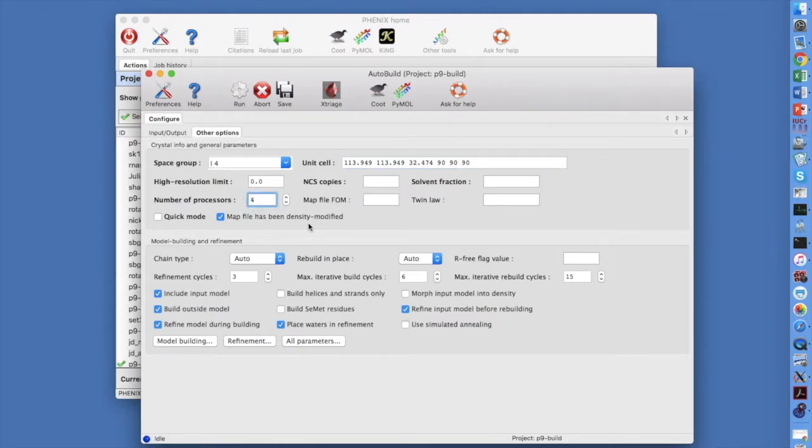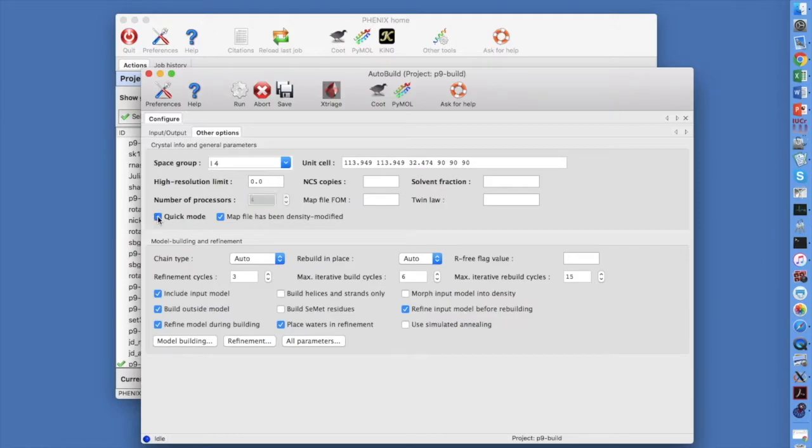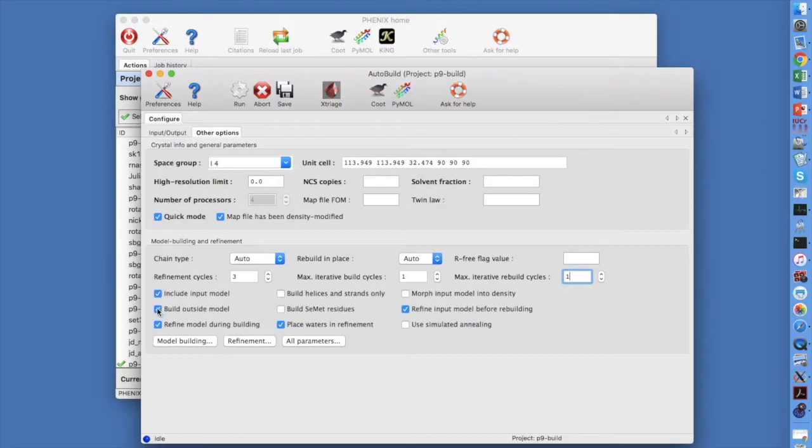Set the number of processors. Now, just to run quickly, select Quick Mode. Set the maximum Iterative Build and Iterative Rebuild steps to 1. Set Build Outside Model to False. This turns off a step where density is removed wherever there is already a model built.